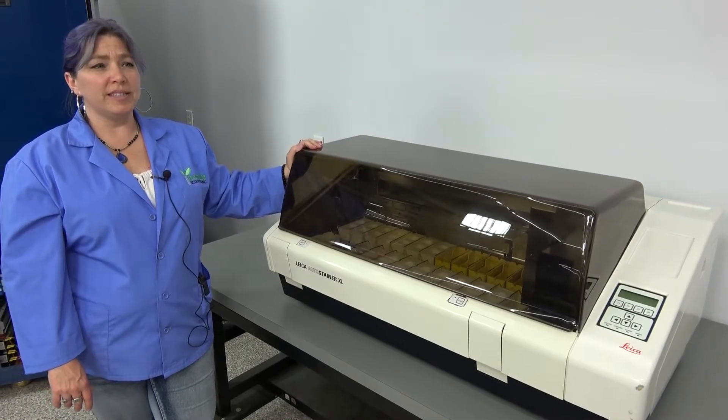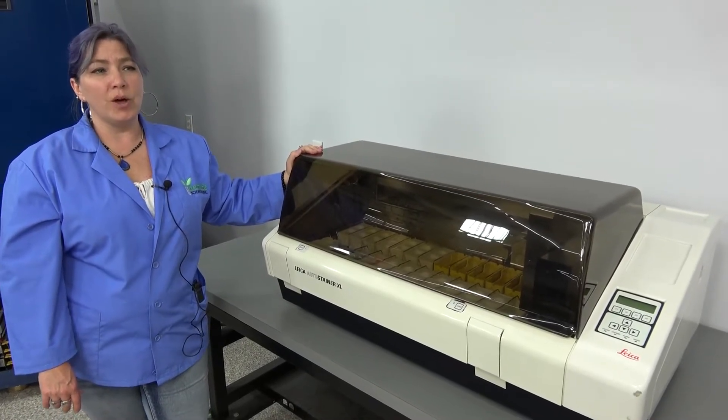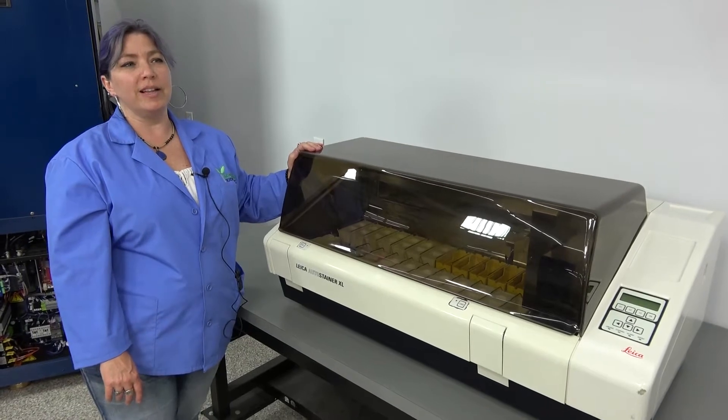Hi, I'm Lori and we're at New Life Scientific and we're here to talk about the Leica Auto Stainer XLST5010.